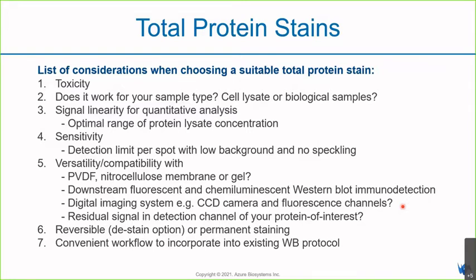And finally, the total protein bands shouldn't give you residual signals, meaning you're still seeing the signal in the detection channel of your protein of interest. Otherwise, it will affect the data that you're going to collect about your protein of interest.